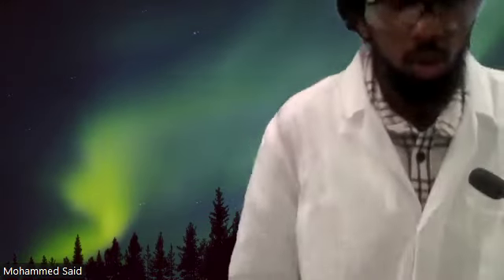That when you look now into the other components of today's lab, you want to be able to see within your slides. You only need 3 slides for today at max. For your unknown, for your positive and negative controls. And the negative and positive controls are in your lab manual, and the bacterium are found in your trays. So you use them as groups to be able to isolate and do perfect smears on single slides. Please bear in mind that you're using single slides for this exercise.